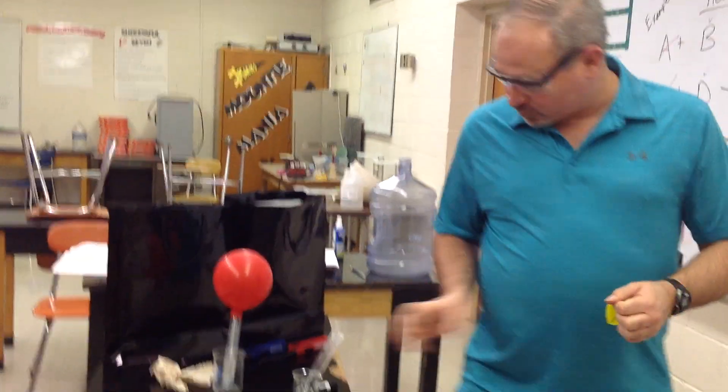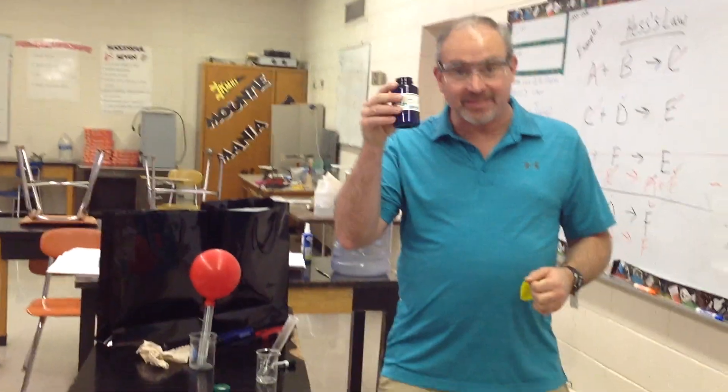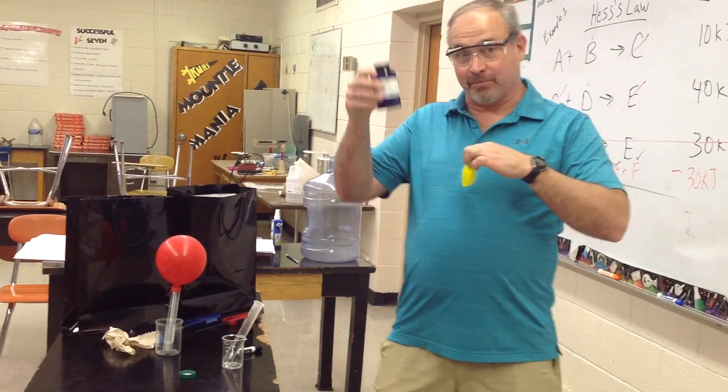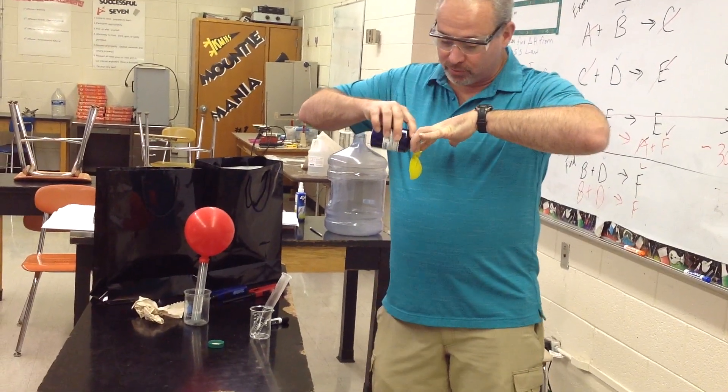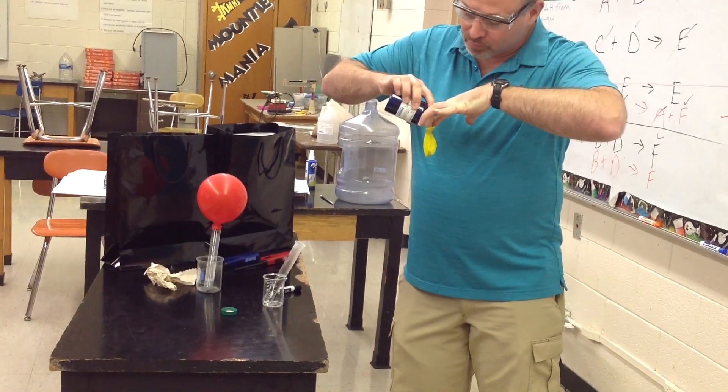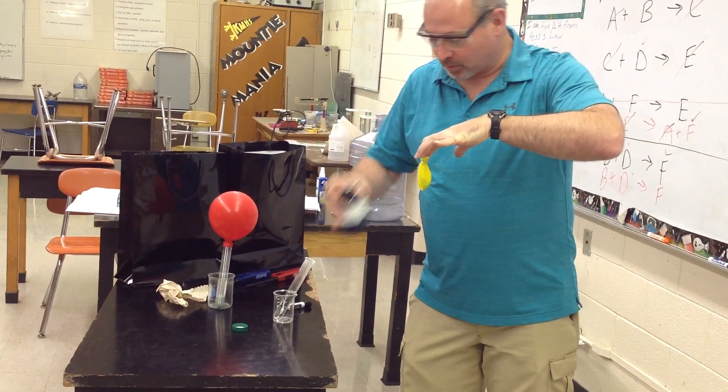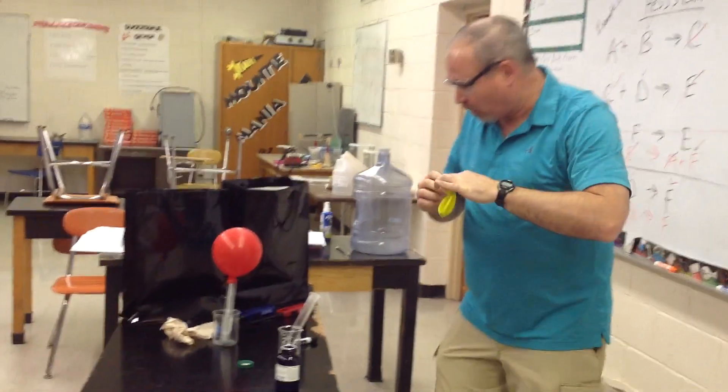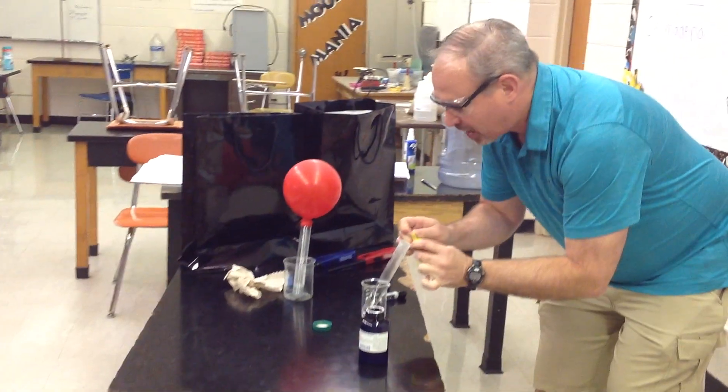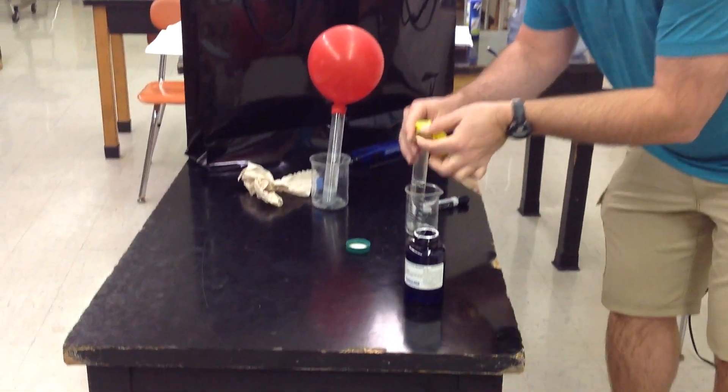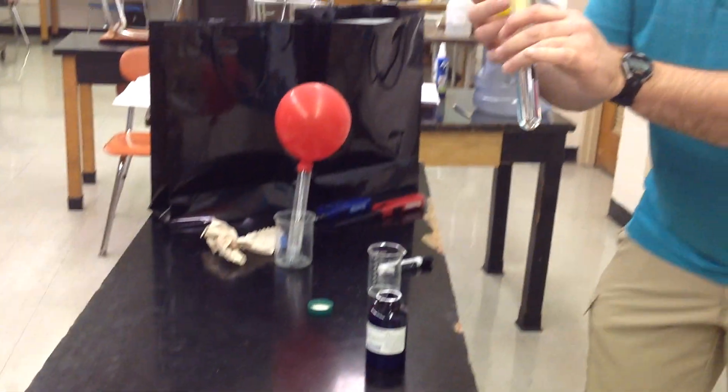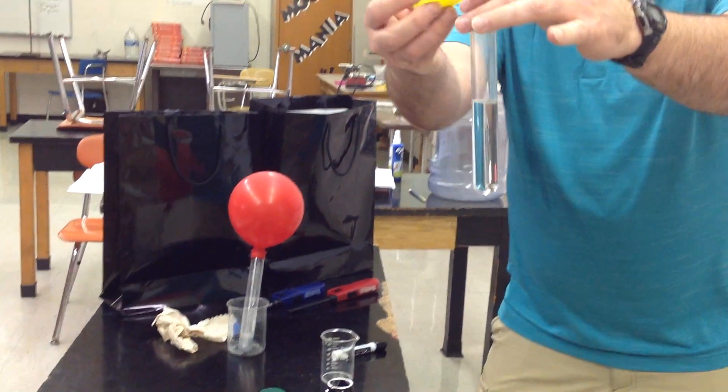To make this real, we're going to put zinc - solid zinc right here - into a balloon. So we've got a good amount of zinc right here at the bottom. We're going to slap this right on top of a test tube containing 6 molar hydrochloric acid.